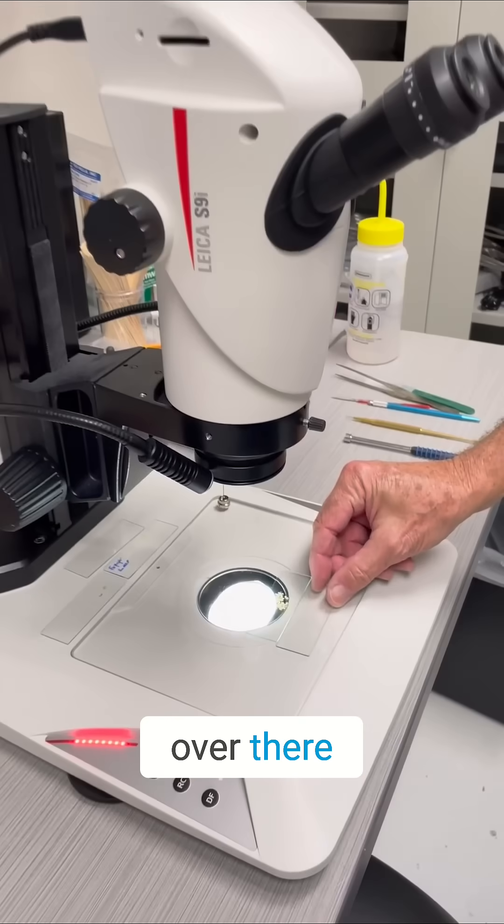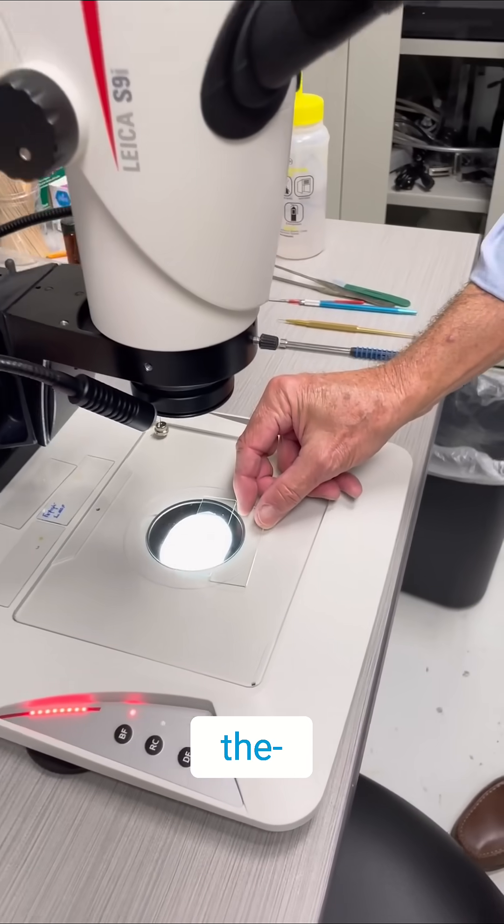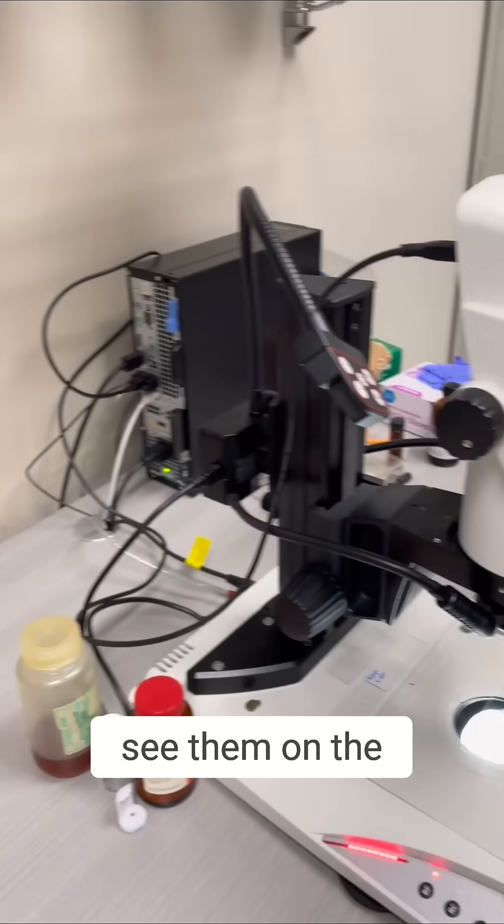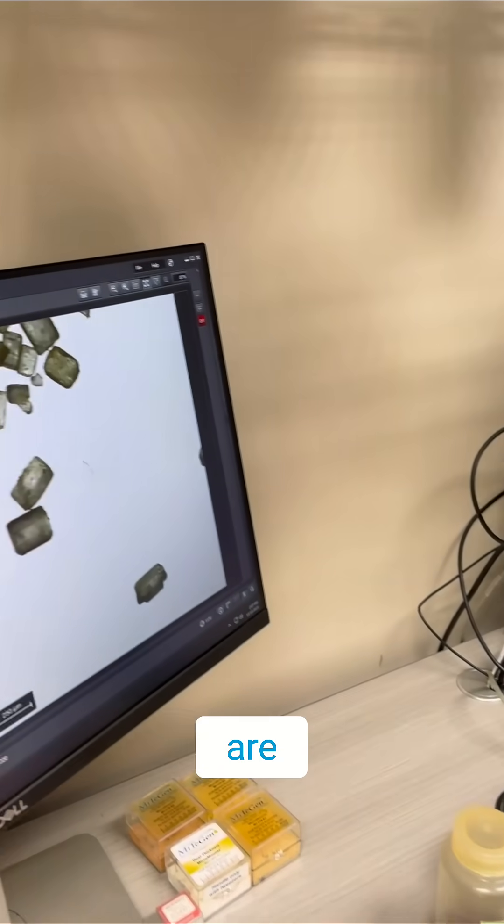So look at the screen over there. I'll slide this in. Okay. So you can see them on the monitor. And there they are, sugar crystals.